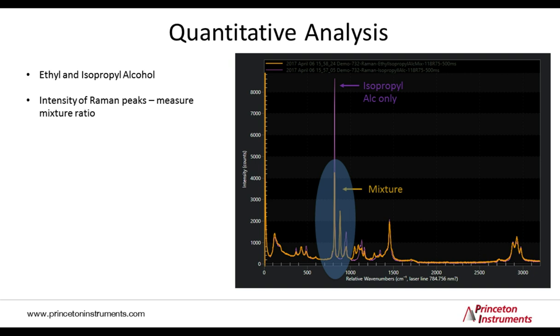By measuring the characteristic properties of the spectrum of the mixture, a quantitative value of the mixture ratio can be found. So for example, a simple approach could look as follows. One could look at the ratio of the individual peaks in the highlighted section of the graph, as these are unique to either the ethyl or isopropyl alcohol. The ratio of these peaks can be calibrated to relative concentrations of the solvents by an empirical model that's determined from intensity ratios of known mixtures. This model can eventually then be used and applied to unknown mixtures to determine the mixture ratio.